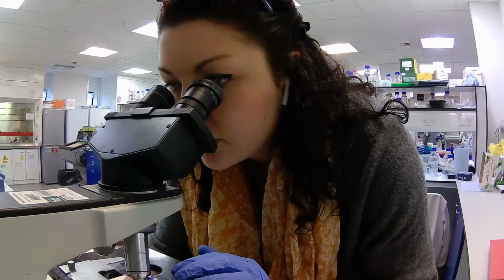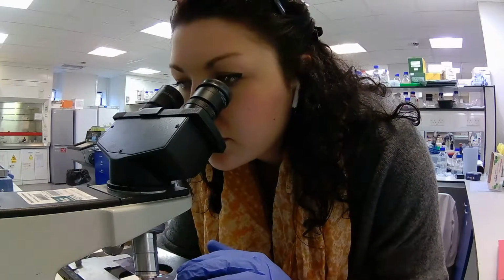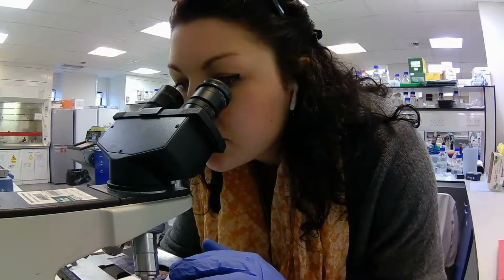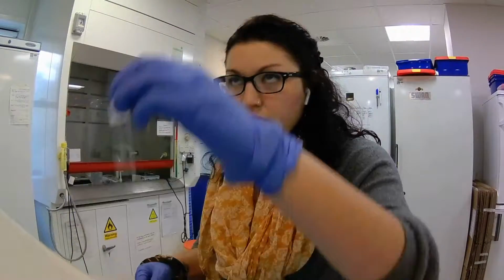That means that later, I can go back and say, look, I just want to do an experiment using hippocampal sections. So sections of just the hippocampus. So I can go to my marker slides and see which 4 slides correspond to that region. Then go and pick out slides 50 to 54 rather than having to guess, oh, it was probably around 50 to 54, because 1, that's a waste of time, and 2, it's a waste of money. And this is just an overall easier way of doing this.